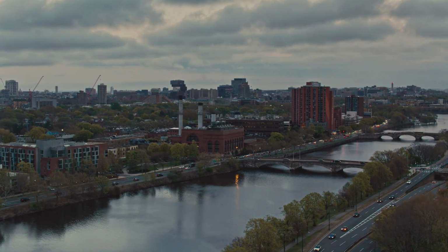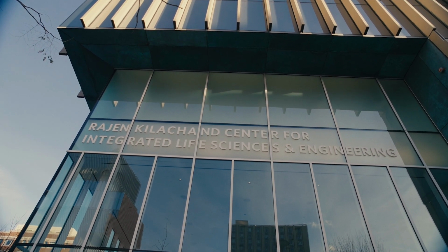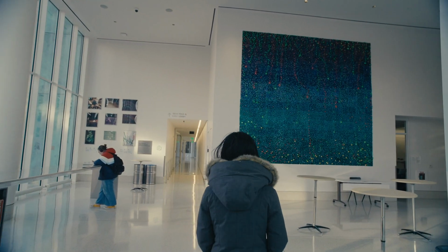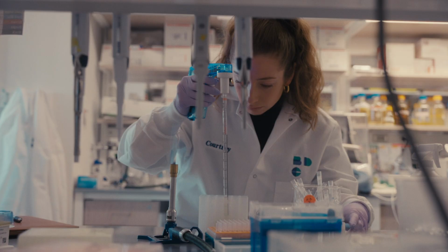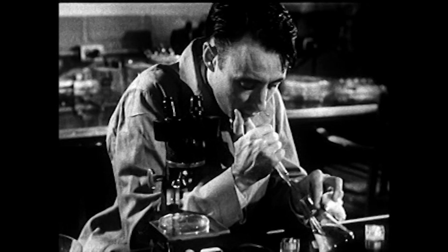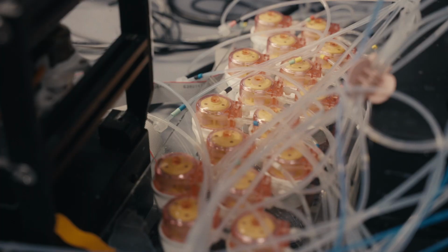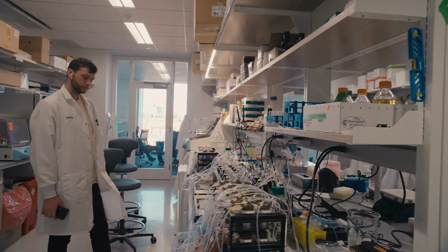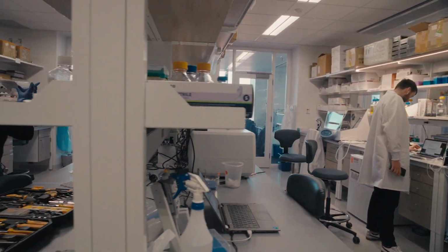The DAMP lab, the Design, Automation, Manufacturing, and Processes lab, is a core facility on the Charles River campus that provides microbiology services to people. I founded the DAMP lab because I needed the DAMP lab to exist. If I make a software tool, and you design a DNA sequence or a novel organism, it has to get off your computer. It can't be one computer, one lab. It needs to be many computers to one lab.